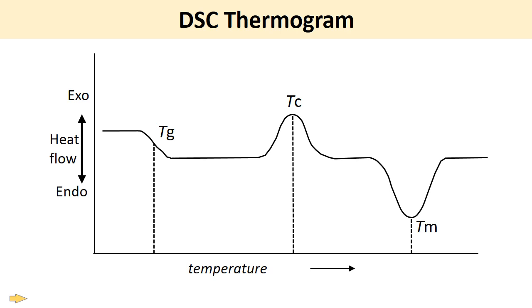And then when further heat is added, our Tm, which is the melting temperature, is reached, which is an endothermic process since heat is added to get to this temperature.